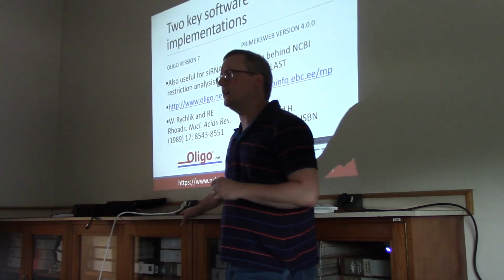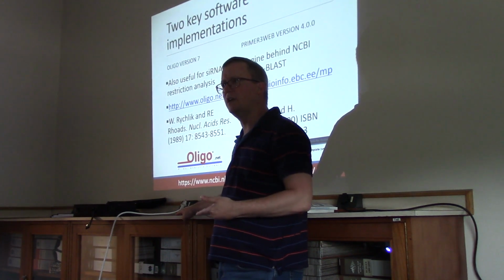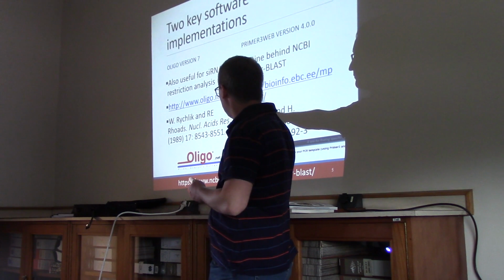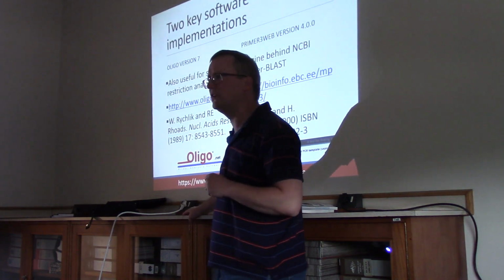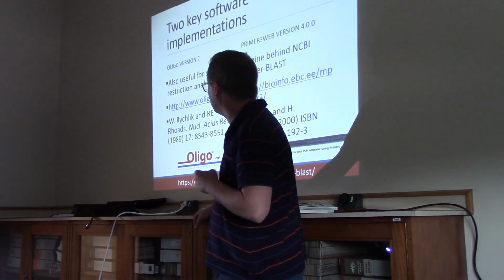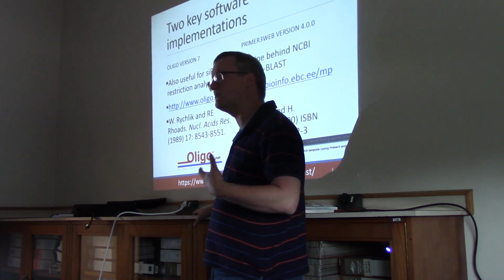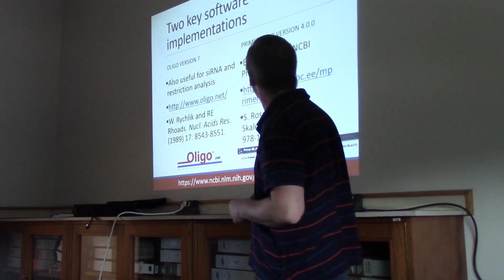Now, I would note that I'm not doing an in-person walkthrough on the software today, but in prior years I've done some online videos at the YouTube channel that talk about how these tools can work. I believe I walked through Oligo 7 in one of those videos. So feel free to look those up. But Oligo 7 is software published way back in 1989. Not Oligo 7, that was, I think, the first edition. But it's been a perennial favorite, and they keep adding new features to it over time. So that's been quite lovely.